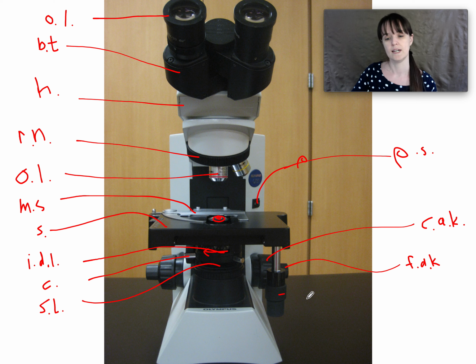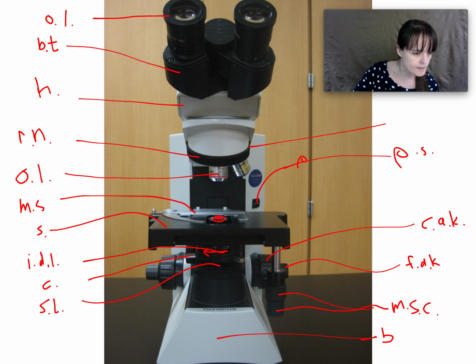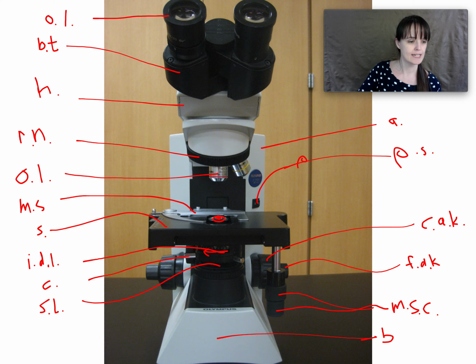Yeah, okay. And then these together are the mechanical stage controls. You got it. Oh, and base. Oops. I have an erase. Just a second. Let me find it. That didn't work. There we go. It worked. Let me go back to pen. Arm. There you go. Next slide.